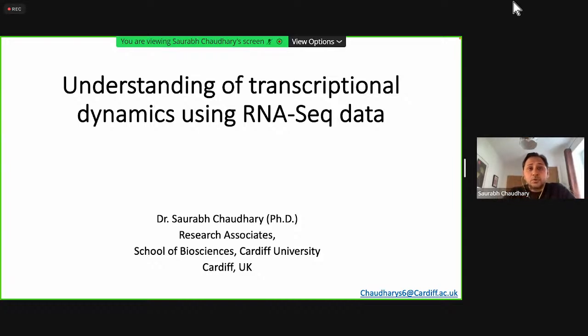there are a number of tools and scripts available online, and you can use those scripts and tools to analyze your data. But the main problem is how you are going to represent your data in your publications and how you are going to interpret that data. So my main focus in these two sessions is how we are going to interpret the data from the RNA-seq analysis, and how we can generate the figures for our data.